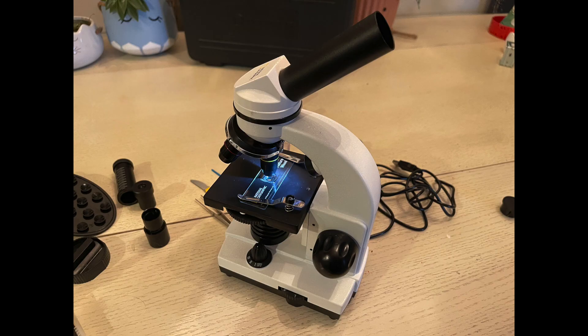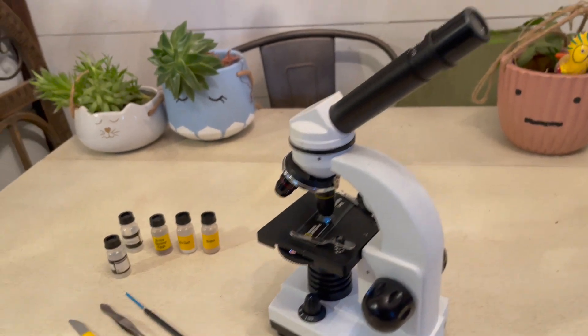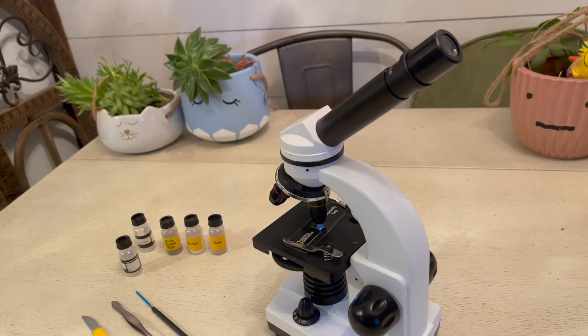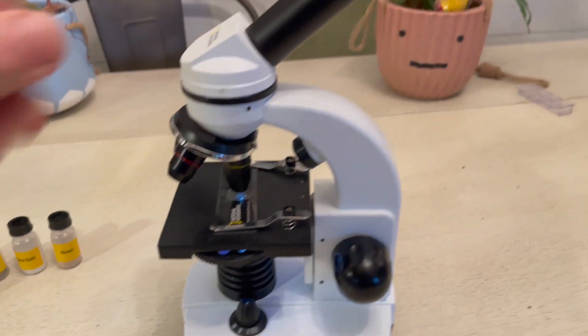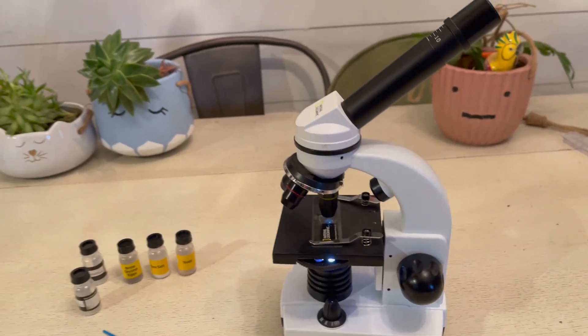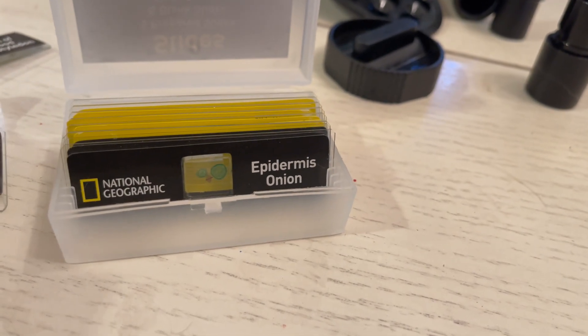There's a dial to turn the light off and on or to switch how the light works — it can either come from the top or the bottom. There's also an adjustable magnification bed so you can zoom in or out depending on whether you're looking at a flat slide or something bulkier.